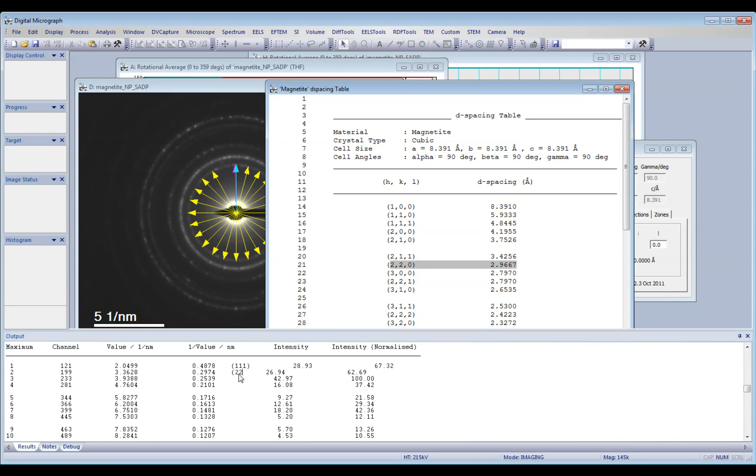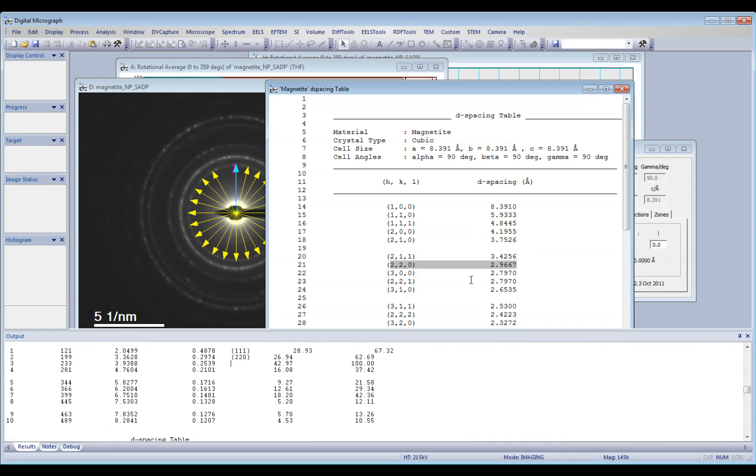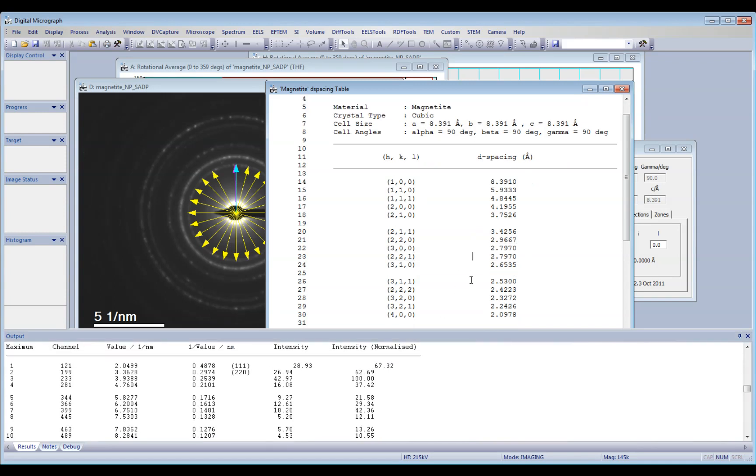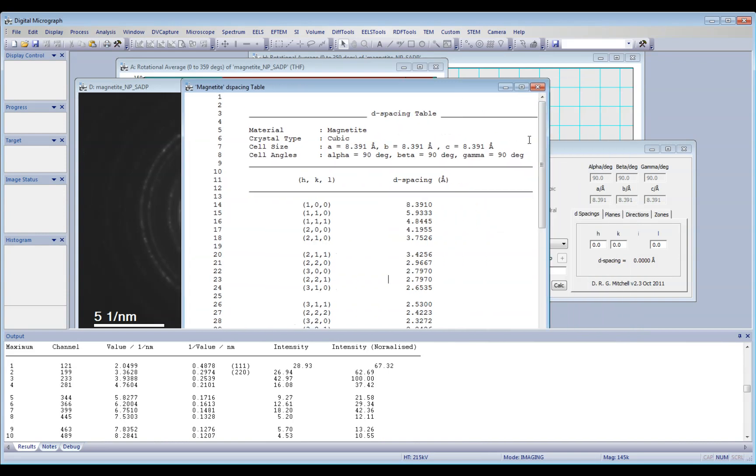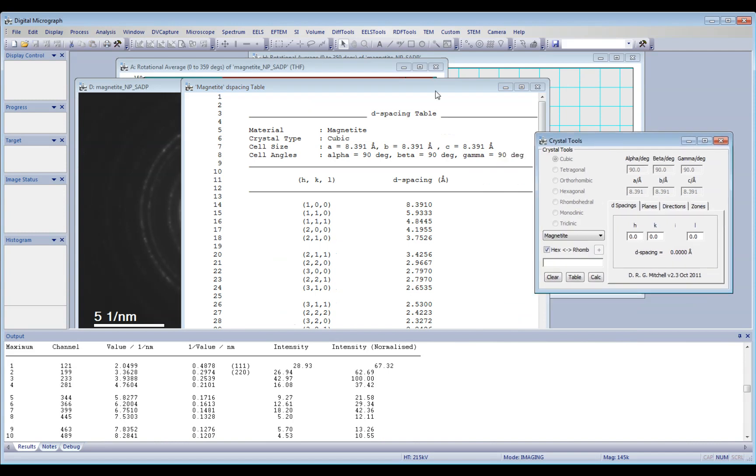Then you compare all the measured planes, or at least the majority, with your HKL D spacing list that you generated using the crystal tools.